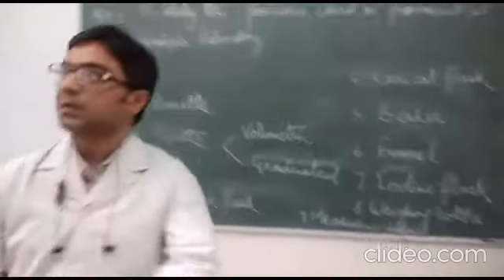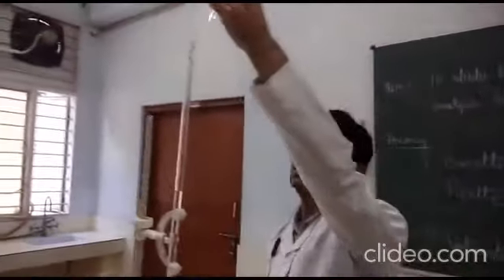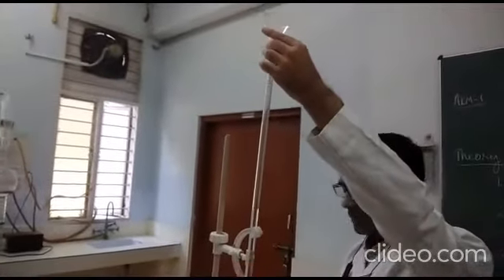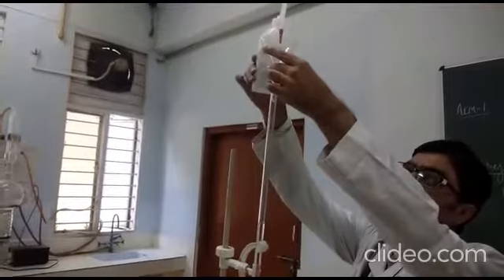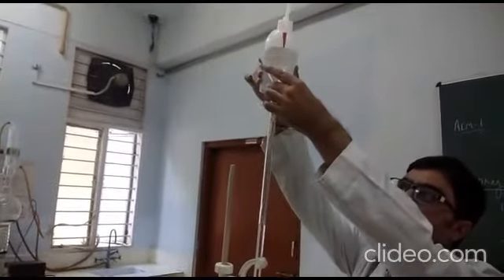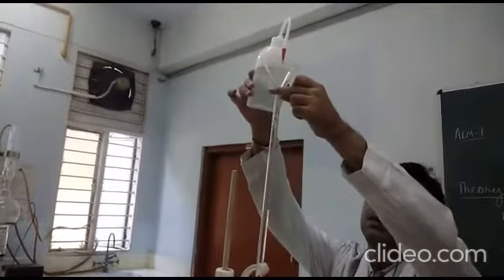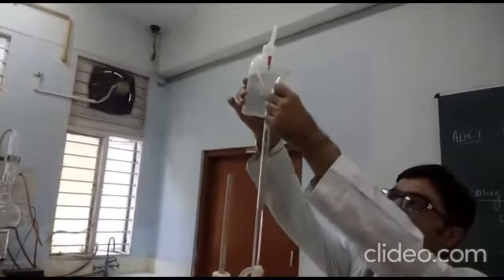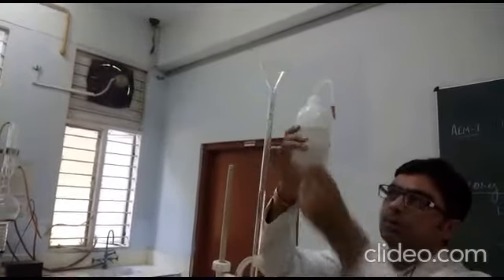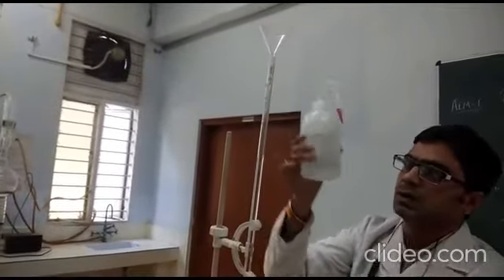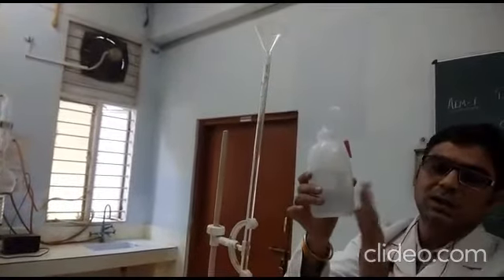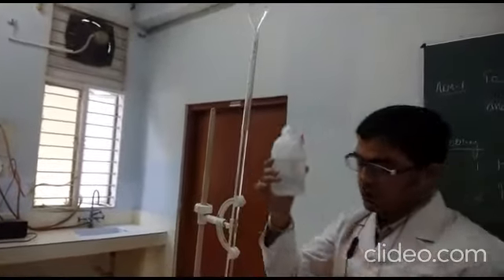Then we have funnels. You can see this funnel which I have placed over the burette. It is placed over the burette and used to transfer solution into it. You can see we are transferring the solution. We also have a wash bottle containing distilled water.